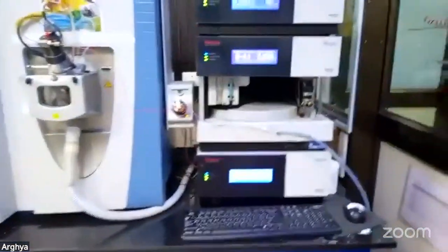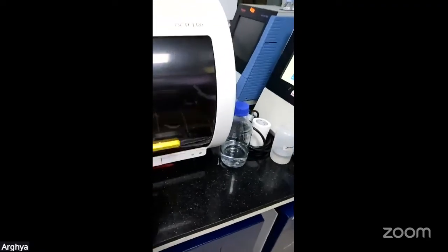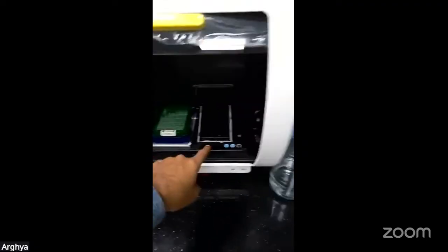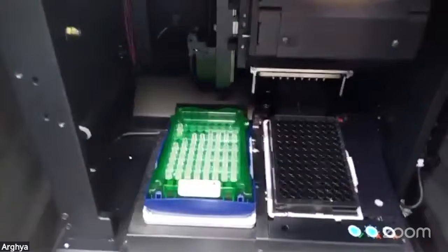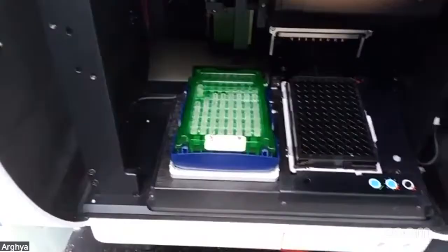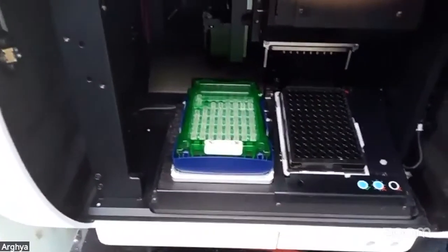Marga, you can show the BLI as well. Yes, this is one added advantage which we will discuss in detail in upcoming lectures. This is biolayer interferometry. You can spot your protein samples onto the plate or matrix, and when an interactor binds, the refractive index changes, which is easily detected.